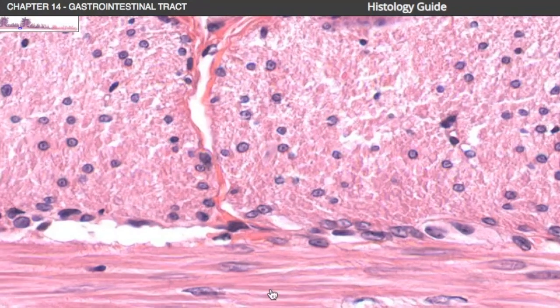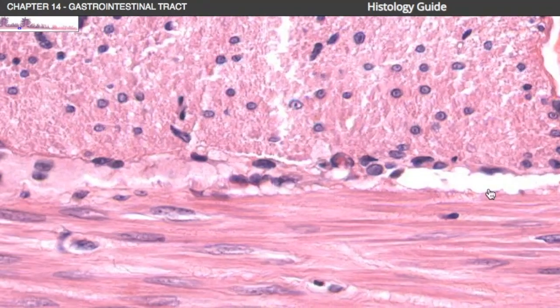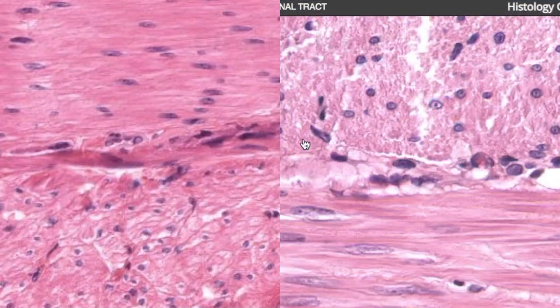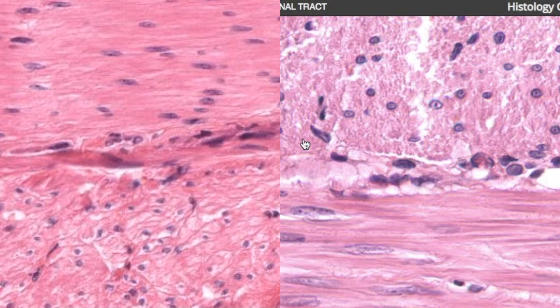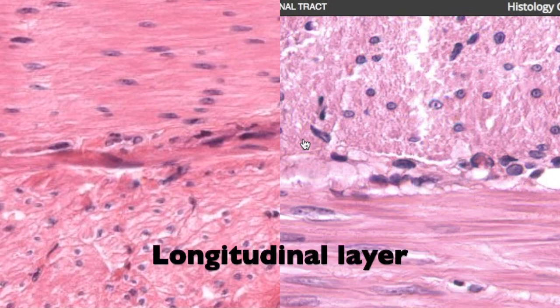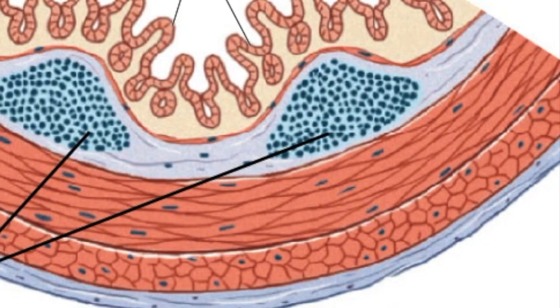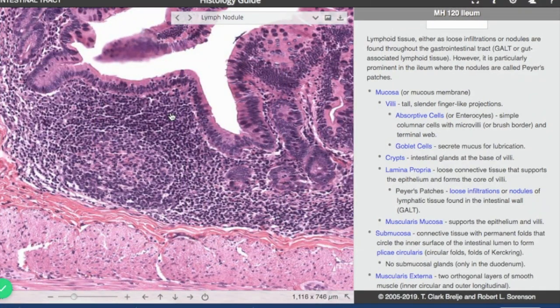You can see the small rounded dots of the inner circular layer and the elongated nuclei of the outer longitudinal layer. Always keep in mind the appearance of whether the cells are elongated or round, as these respective layers will switch depending on whether you're looking at a cross-section or a longitudinal section. Also shown here in the submucosa — but really in the mucosa — are congregates of cells from the immune system.